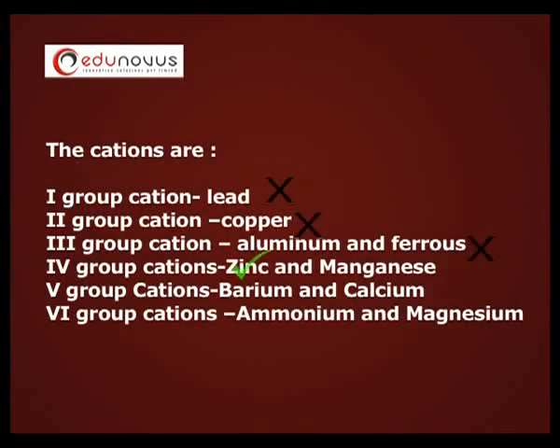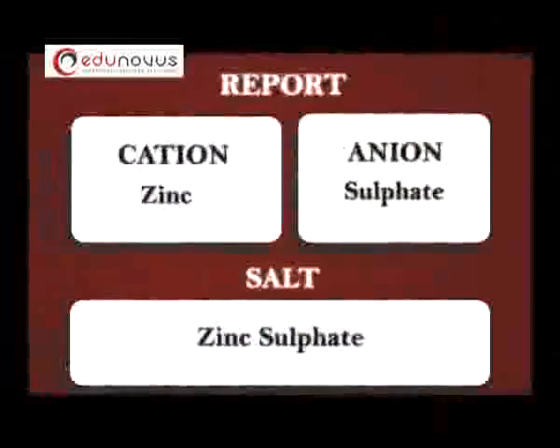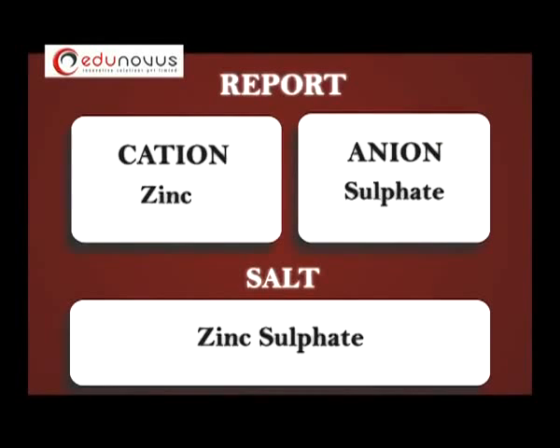Thus, zinc is confirmed. Thus, the given salt contains zinc cation and sulfate anion. Therefore, the final report of the salt is zinc sulfate.